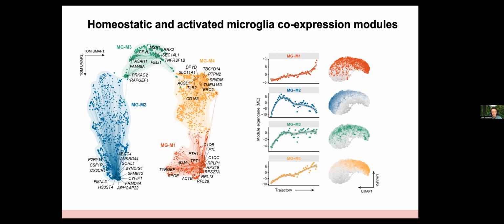The M3 one might have fewer, but you can mess with the dynamic tree cut parameters a lot to give you fewer or more modules. I think 4 might be a low number of modules compared to what you would expect. With the consensus network analysis, you might end up with fewer modules than doing it separately as well. But I don't have the number right off the top of my head. And ultimately, the size is just determined by the algorithm, the dynamic tree cut algorithm.